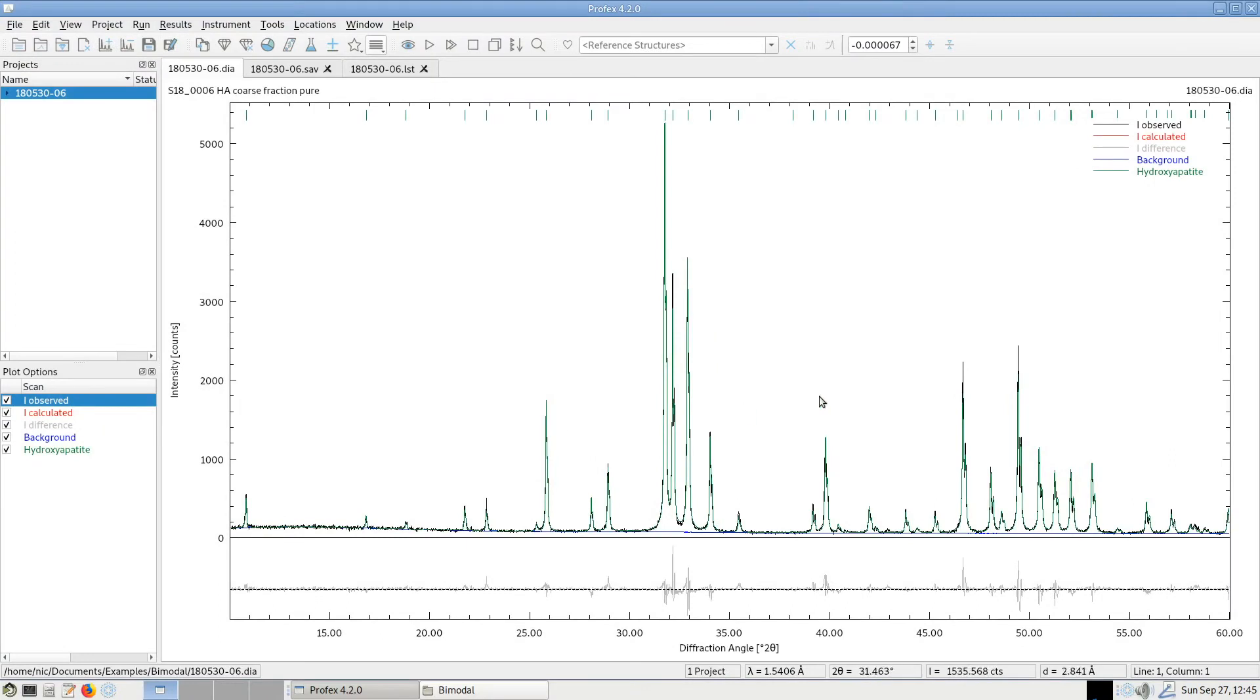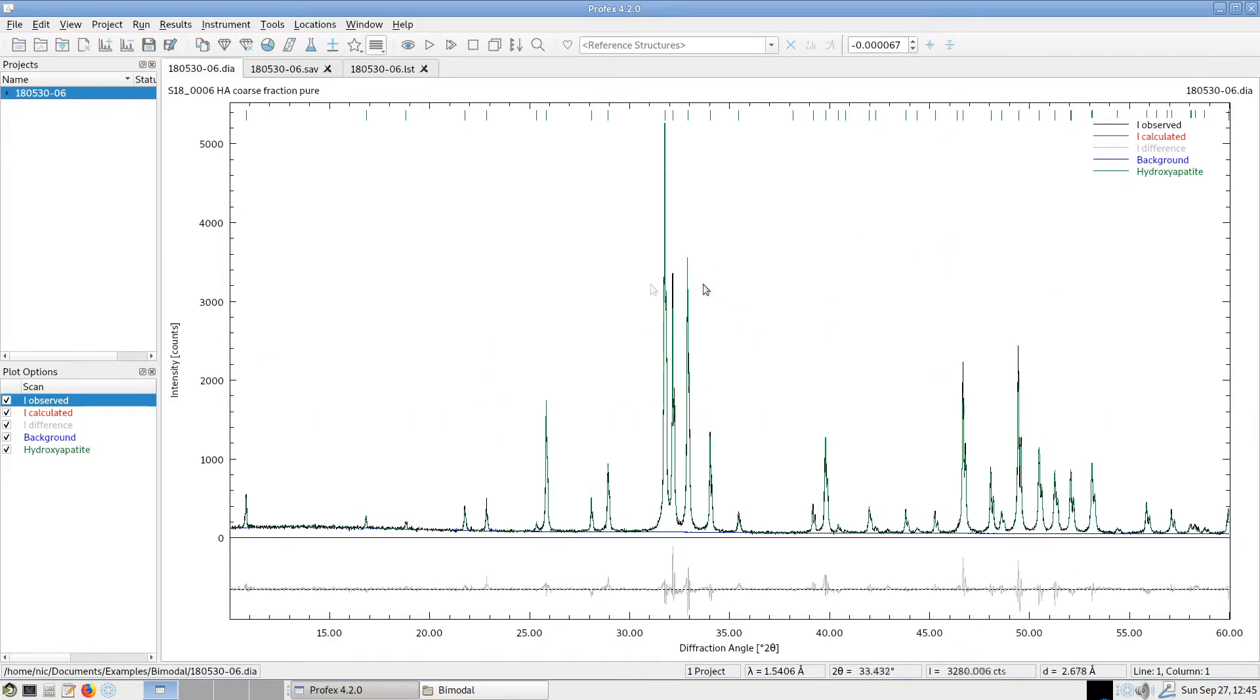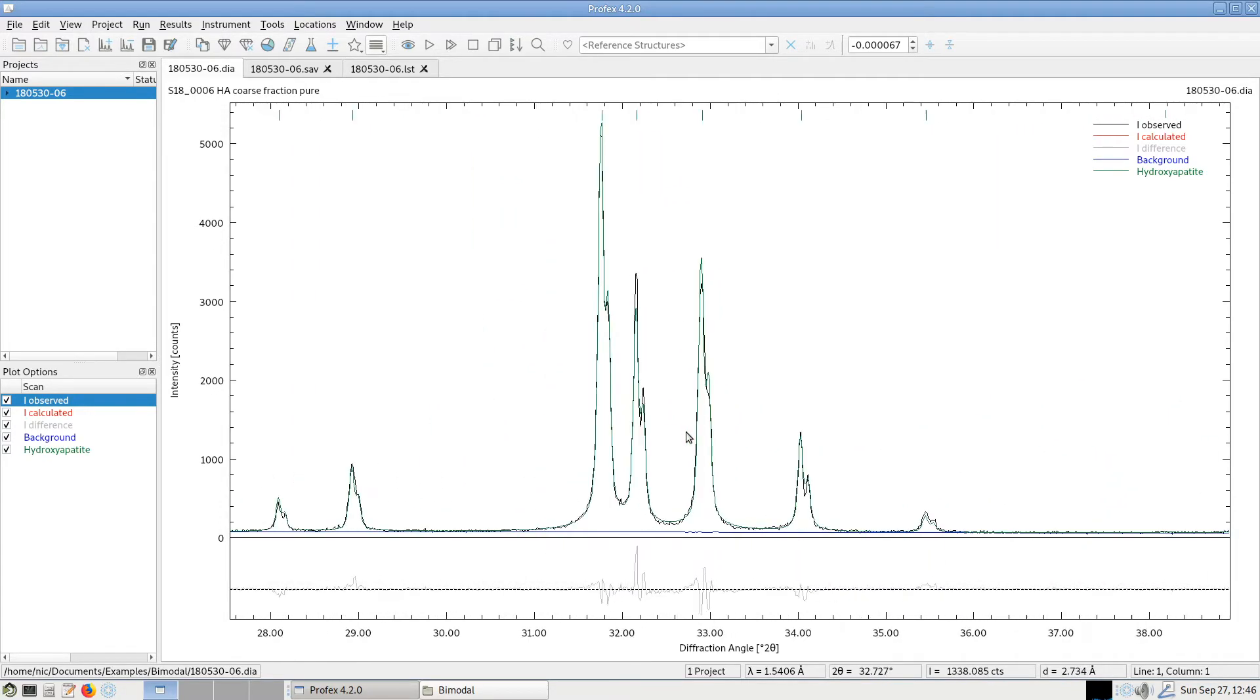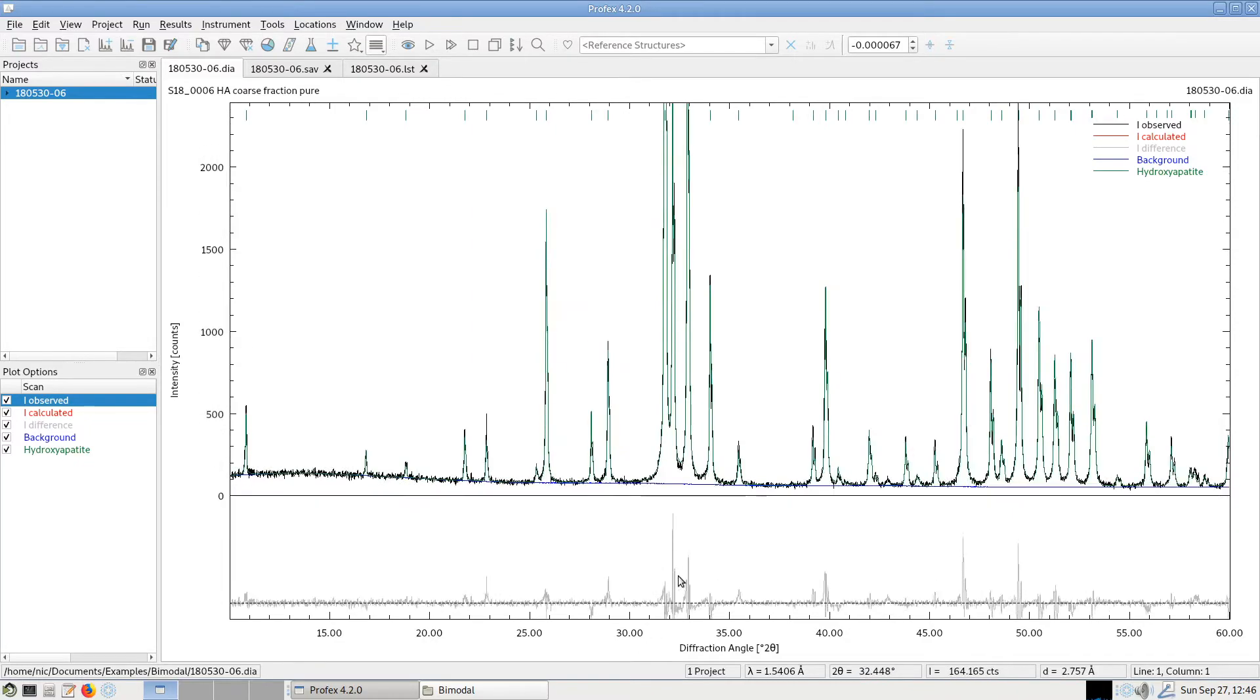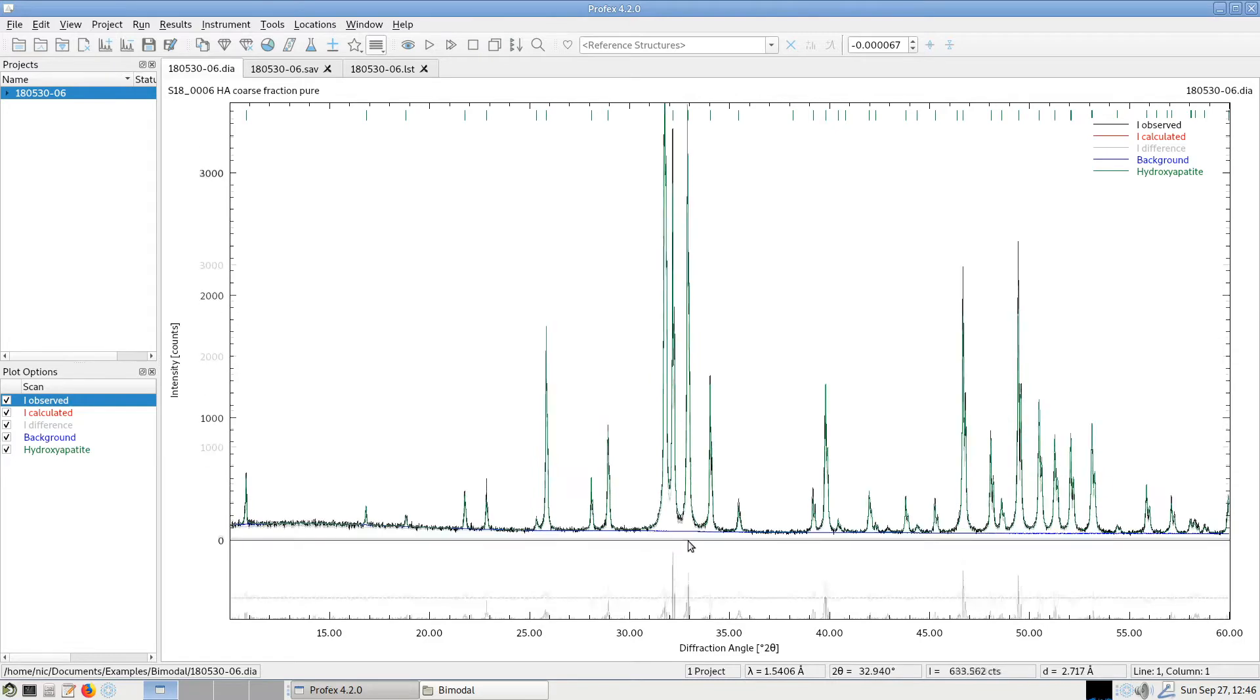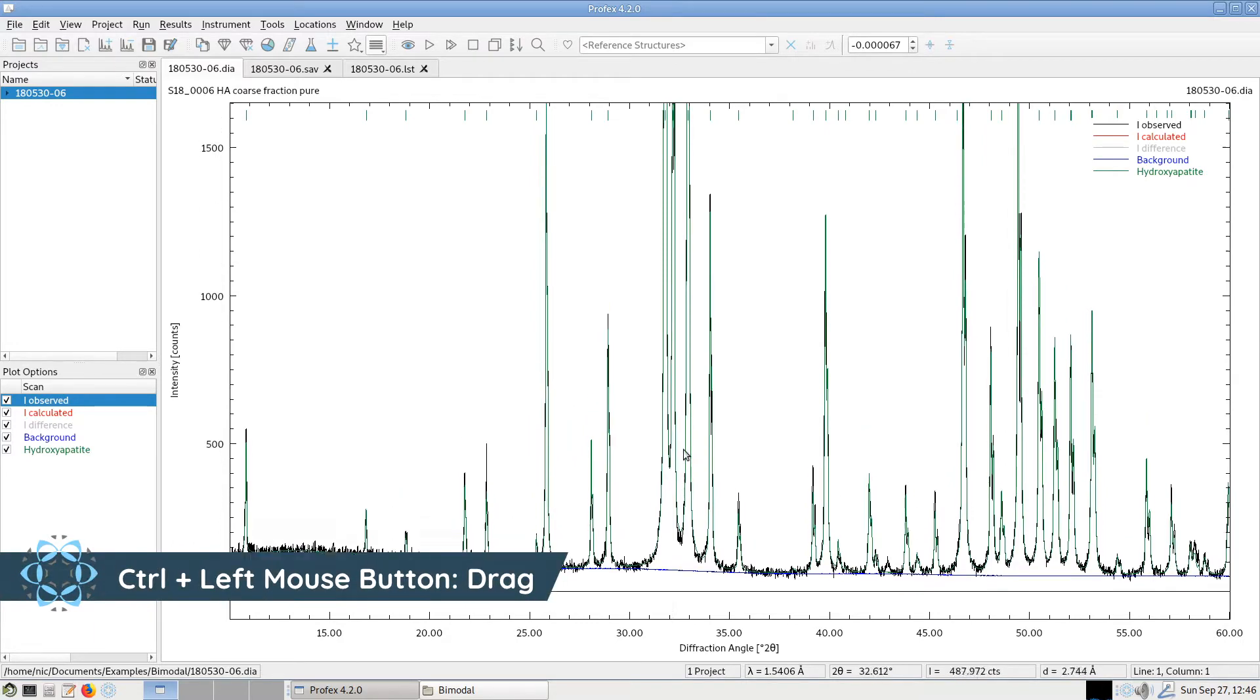First of all, in the main plot area we can use the mouse to zoom in using the left mouse button. Using the right mouse button we can zoom out to reset the zoom value. With the scroll wheel we can zoom in horizontally and zoom out again. If we hold the Ctrl key and use the scroll wheel we can zoom in vertically. If we keep holding the Ctrl key we can use the left mouse button to drag the scan around.